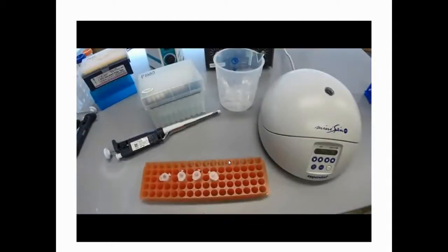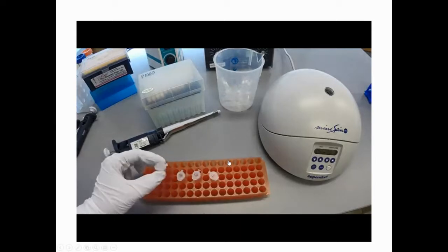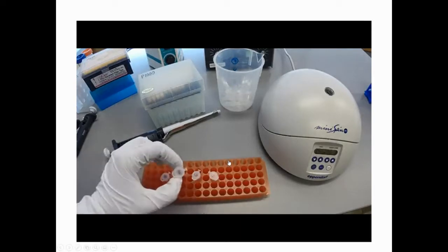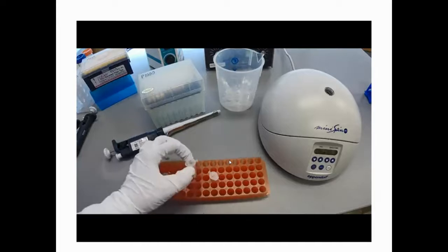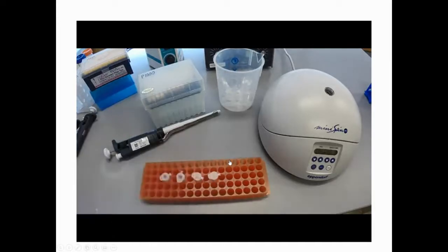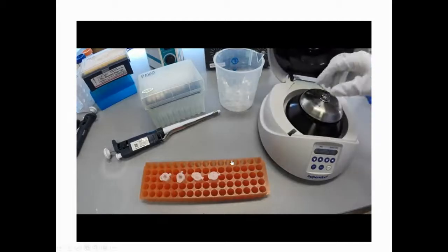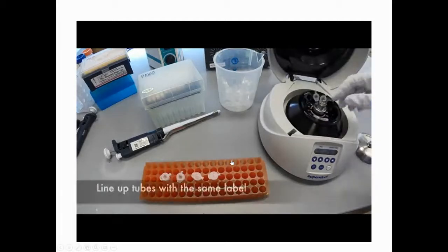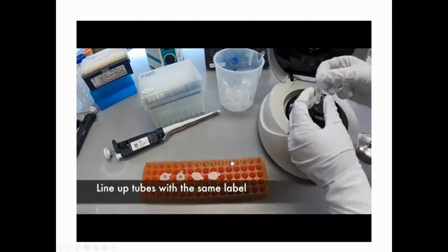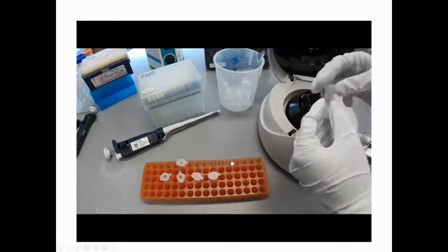As the spin is going, obtain 4 new tubes and label them. When the spin is complete, the lid to the centrifuge will pop open. Remove the internal lid and remove the samples gently to avoid disturbing the pellet. Place tubes of the same sample in line with each other to ease the transfer of the solution.